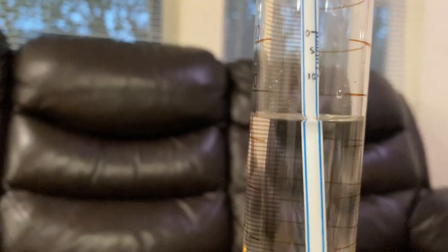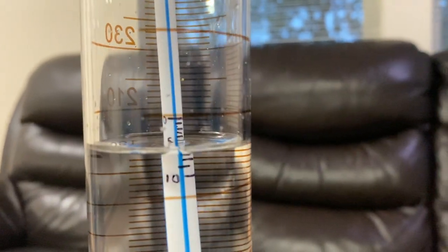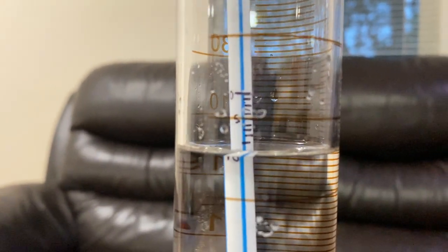I will now dry our salinometer and place it in our 5% salt solution. I will now dry it off again and place it in the 10% salt solution. As you can see, it's touching where the 10% marking is, because this is a 10% salt solution.